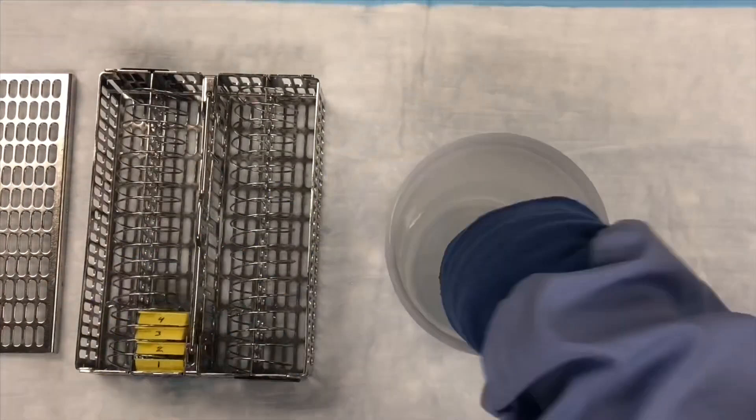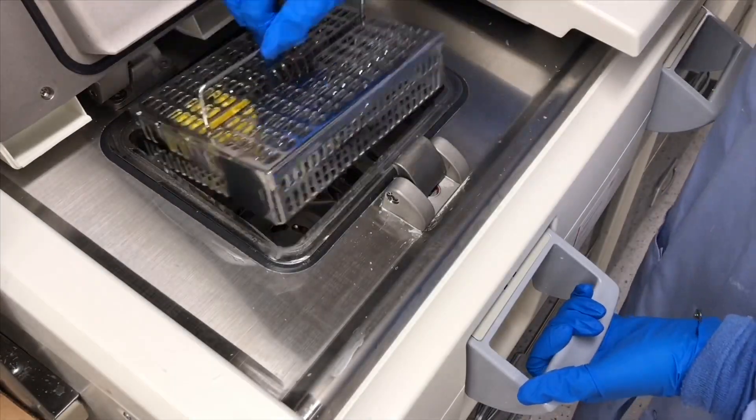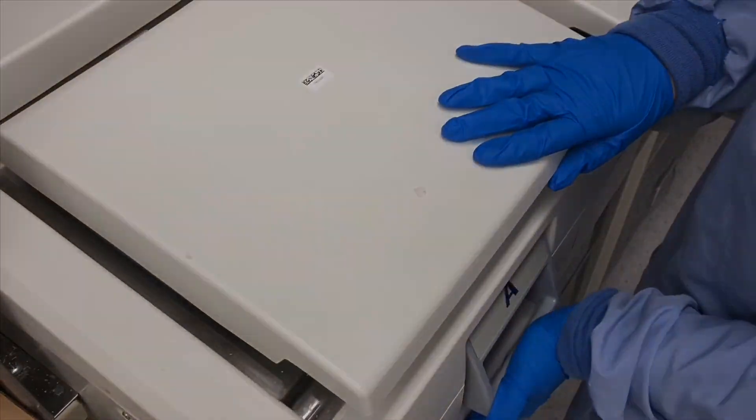Tissue submitted in cassettes gets loaded into the processor, where it's processed through alcohols and xylenes and then infiltrated with paraffin wax. This runs overnight.